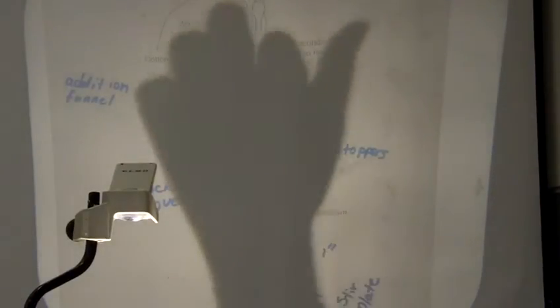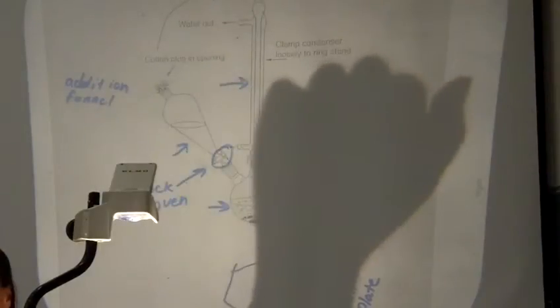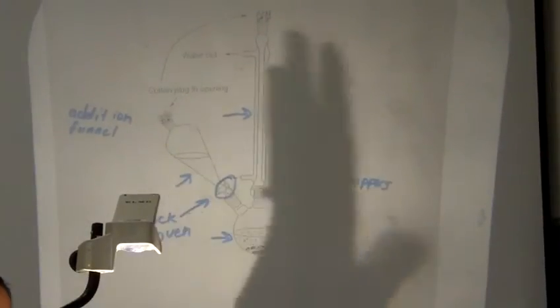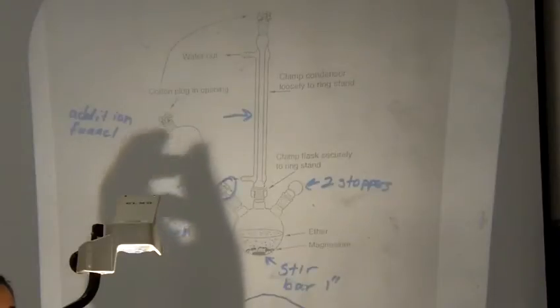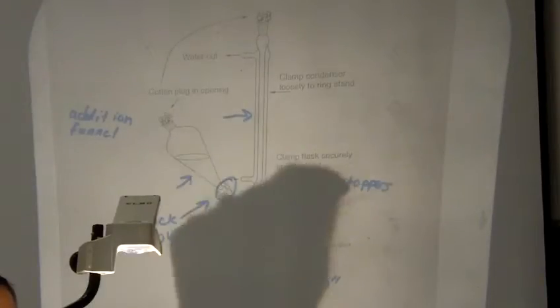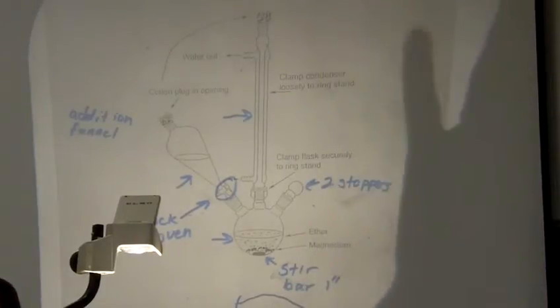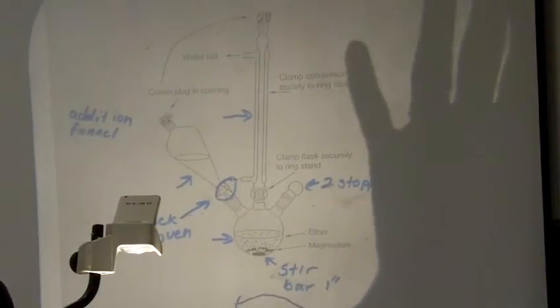Now for this glassware, before you stick it in the oven, make sure you label it either in pencil or Sharpie, so you hopefully get your glassware back out of the oven, but if not, everybody's putting the same thing in, so you'll get something similar to what you had back out again. And this has to heat in the oven above 110 degrees for about a half an hour, okay? So we're going to get this glassware all in the oven before we start the quiz.